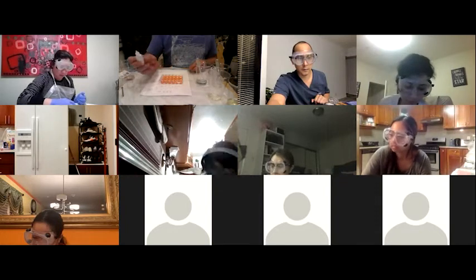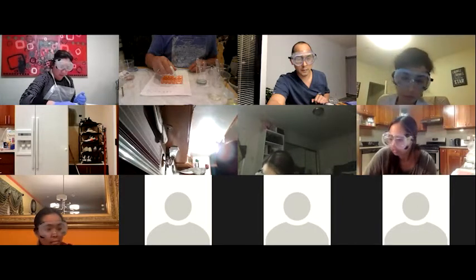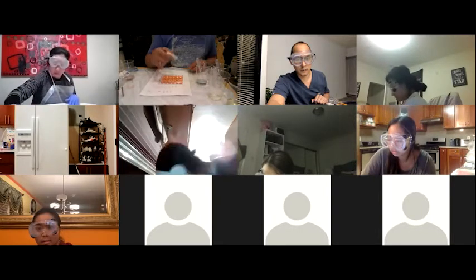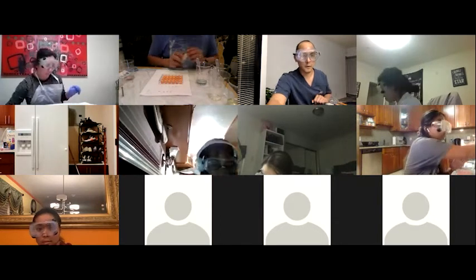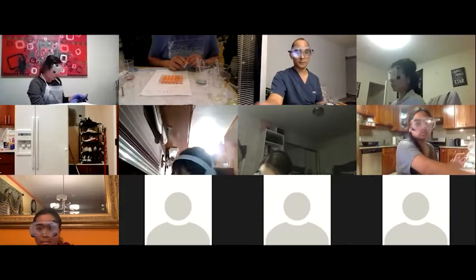So here we go. Make sure I have the right one. Yep, sodium hydroxide. 1, 1, 1, 1. And what you'll notice is that it does change color, but not all the way through.